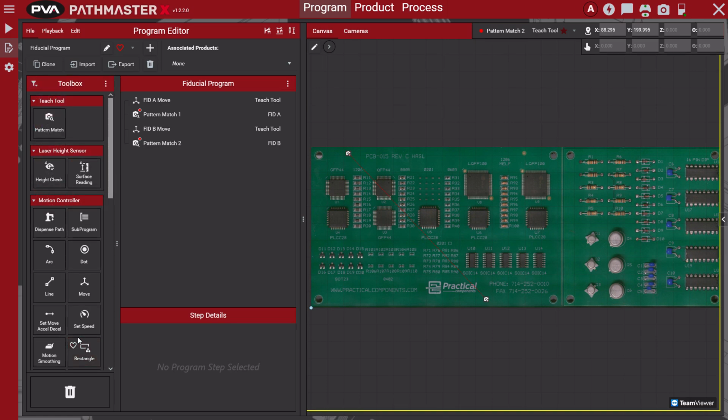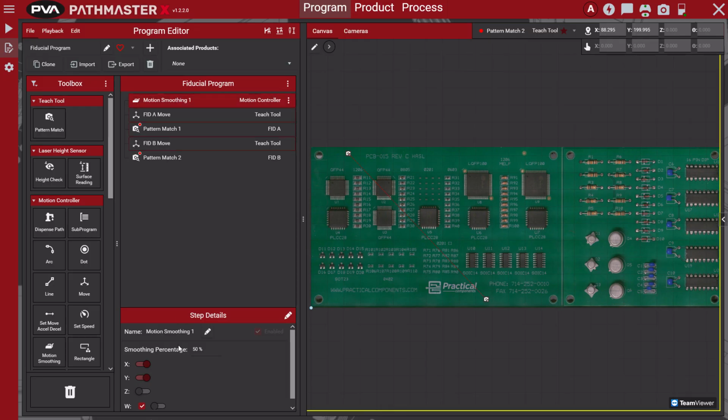When adding steps to a program, they will show in sequential order of execution. Steps can be reordered by clicking and holding them, and then dragging them to the proper place in sequence before releasing them. An indicator bar will appear to display what 2 steps the current step will go between when released.